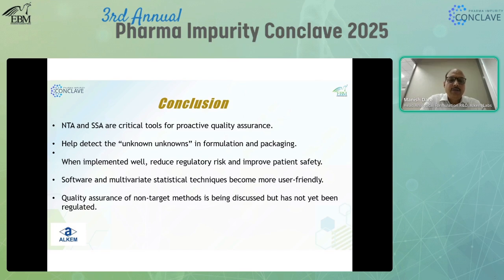And finally, for quality assurance, the non-targeted method is being discussed, but has not yet been regulated. As I said, every company, every analyst is going to develop the method, validate the method, and submit it to the agency. But the database in the regulatory body or maybe any pharmacopoeia is not yet established.